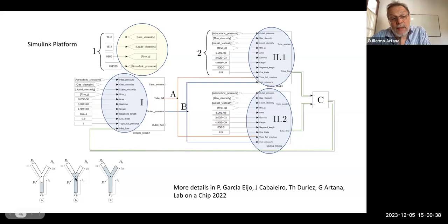We have developed a code in which you can graphically add modules and construct the network in which you are interested, and this should reproduce the dynamics of the filling of the different branches. As I repeat, the graphical environment is quite easy to use, but there are a lot of equations behind it that you don't need to manage or handle. This is already incorporated in the system.